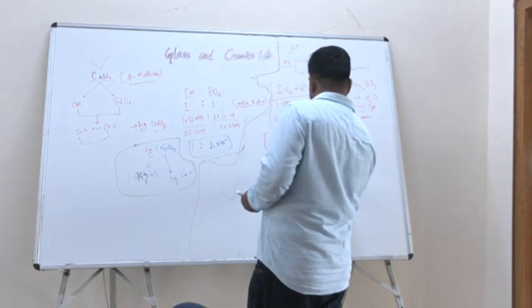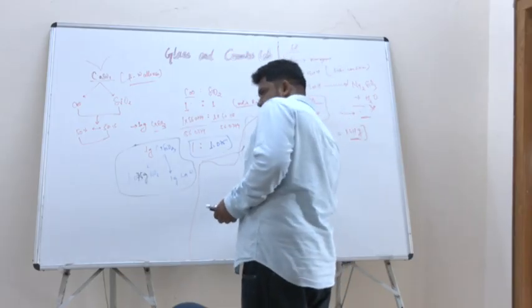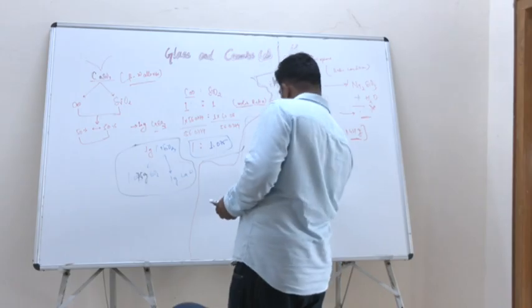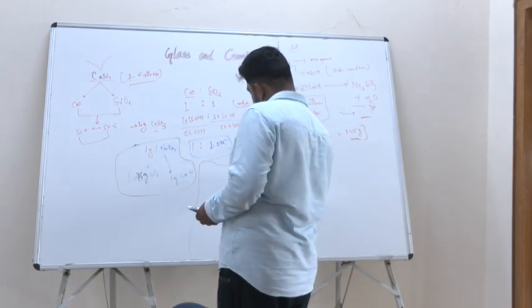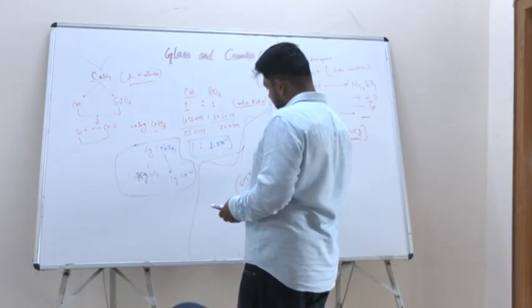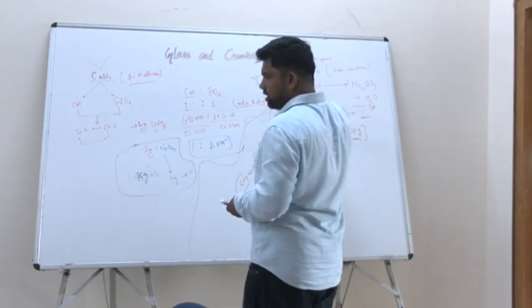Do you know what moles are? Because we need to prepare 2 molar NaOH. In this solution, we will dissolve SiO2.